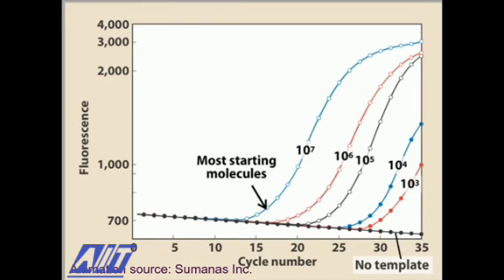In contrast, in the standard PCR technique, the reactions are retrieved at the end of the cycles, when the reactions are no longer running efficiently due to limiting reaction components, and are therefore not quantitative.